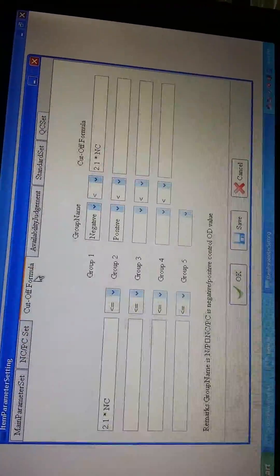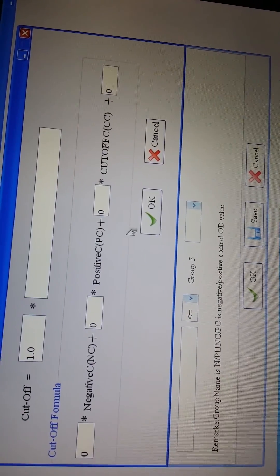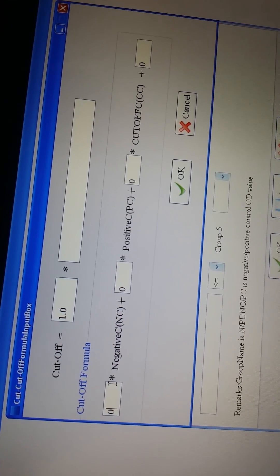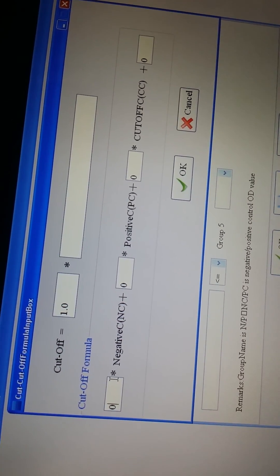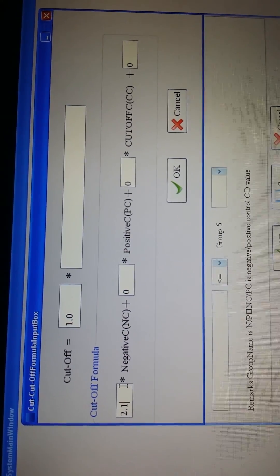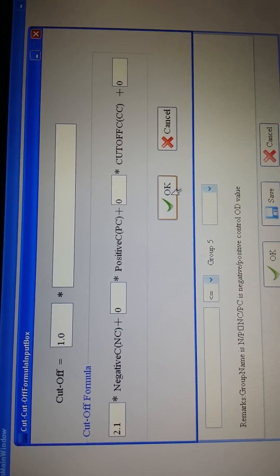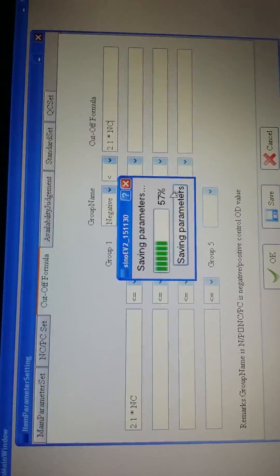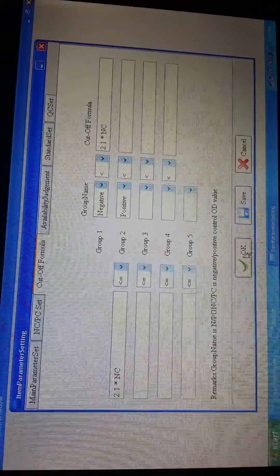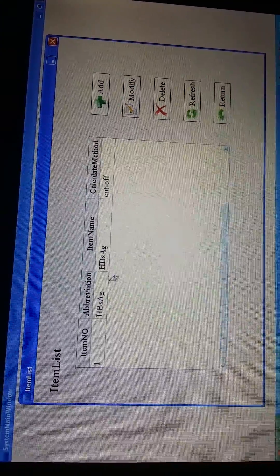Then are the cutoff formulas. Press here and put in the numbers of the formulas — the numbers are also according to the reagent specification. After we put in the numbers, we press OK and save. Now this item HBsAg is finished.